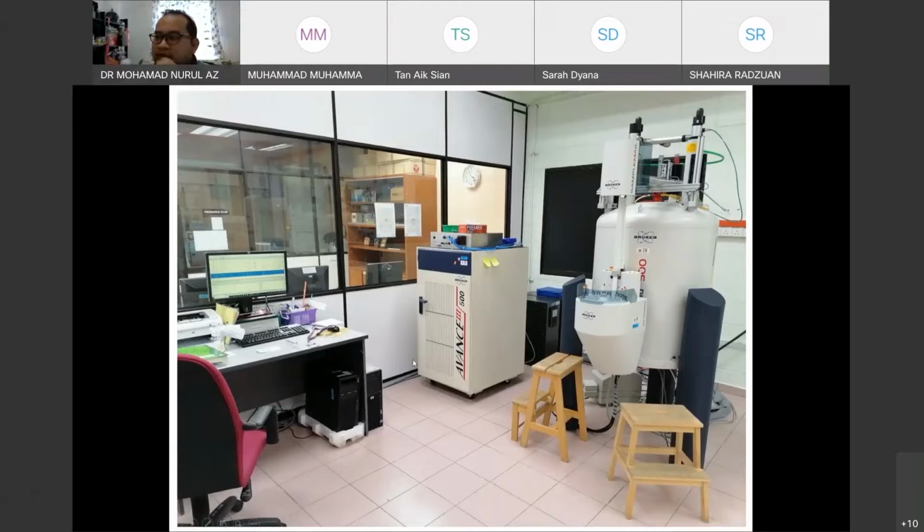The second one is the console. All the electronic boards are there. The last one is the magnet with the sample changer. If we don't have money, we can uninstall this one and do it manually, just put the sample on the top manually. It's not really convenient if we have a weekend slot or long holiday slots, so it's okay.